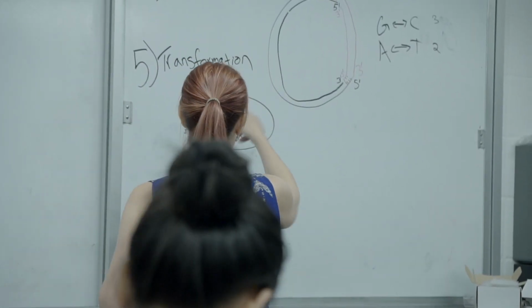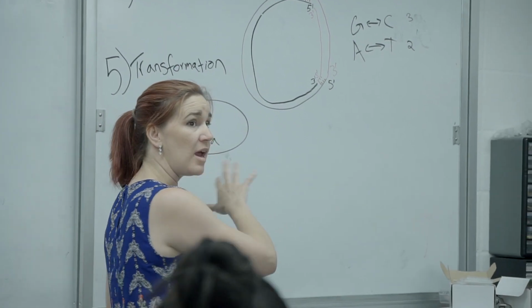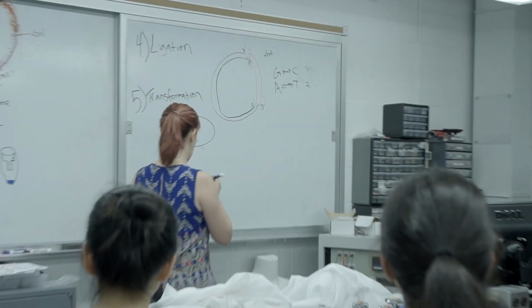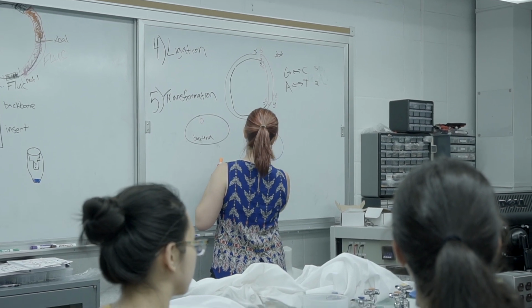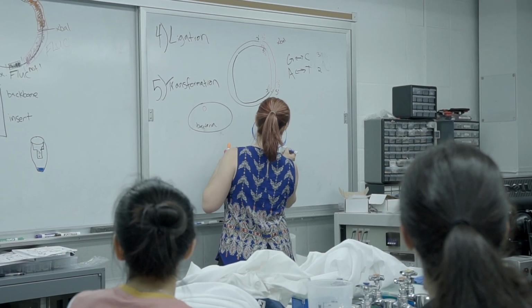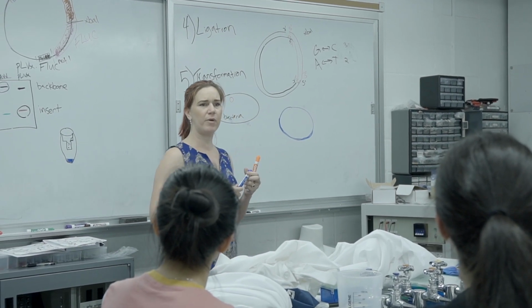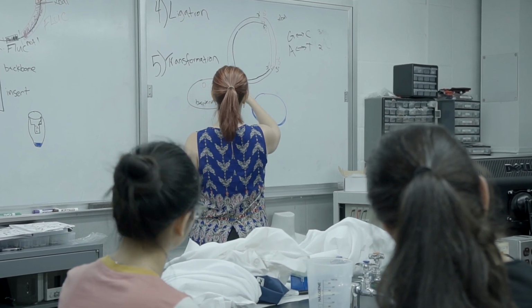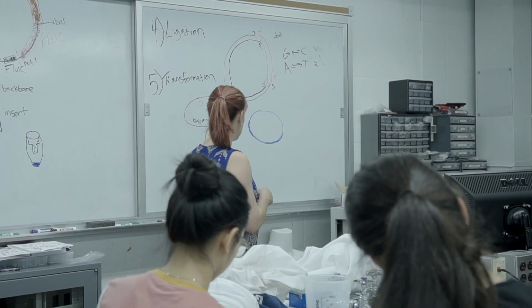So then I'm going to let this bacteria recover for about 30 minutes. And then not all of my bacteria is going to have gotten my plasmid. So I'm going to spread my bacteria out. So let's make a plate. So here's my plate. Have you guys in your biology classes spread bacteria before? On a plate, streak a plate? Yeah, that's pretty common. So I have a tube of bacteria that I heat shocked, and I'm just going to spread it over this plate.